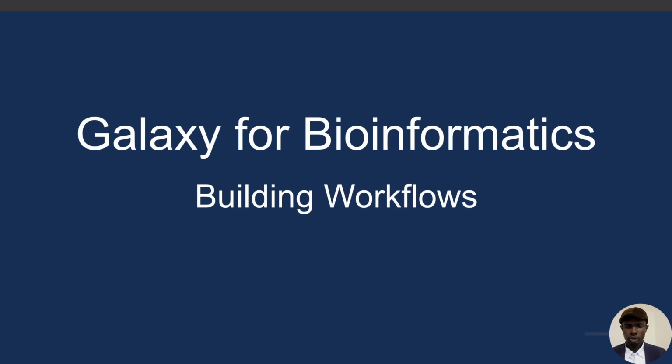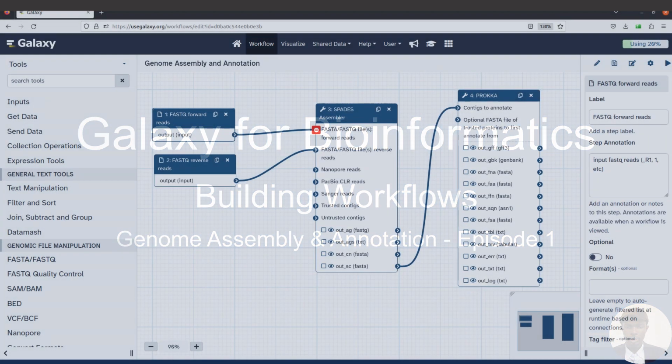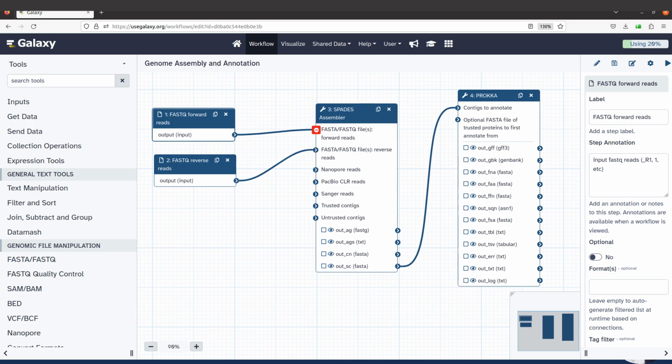In today's tutorial, we are going to look at how to build a Galaxy workflow. So I will start with this workflow here. We are going to build a genome assembly and annotation workflow. This is the first episode in this particular series, I mean the genome assembly and annotation workflow building, right? So by the end of this tutorial, we are going to generate this workflow which is being shown right now.